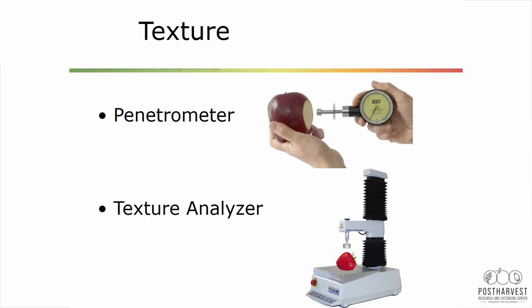I saw you coming, Dennis. Right? Why do we say this? This is not what you should be doing. Not a solid base. Exactly. So always have a solid base, because otherwise you're not going to be precise enough when putting your probe in, right?